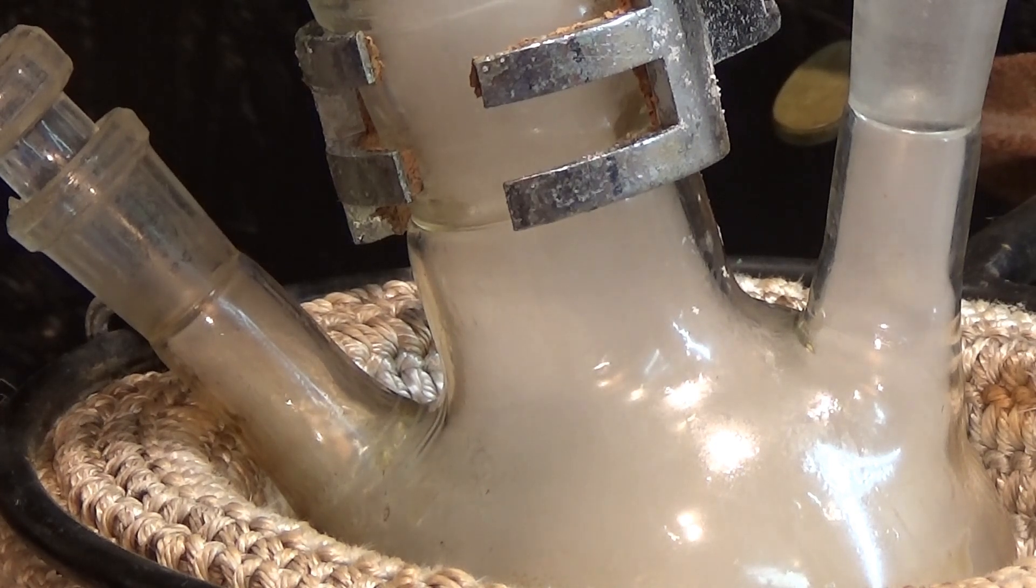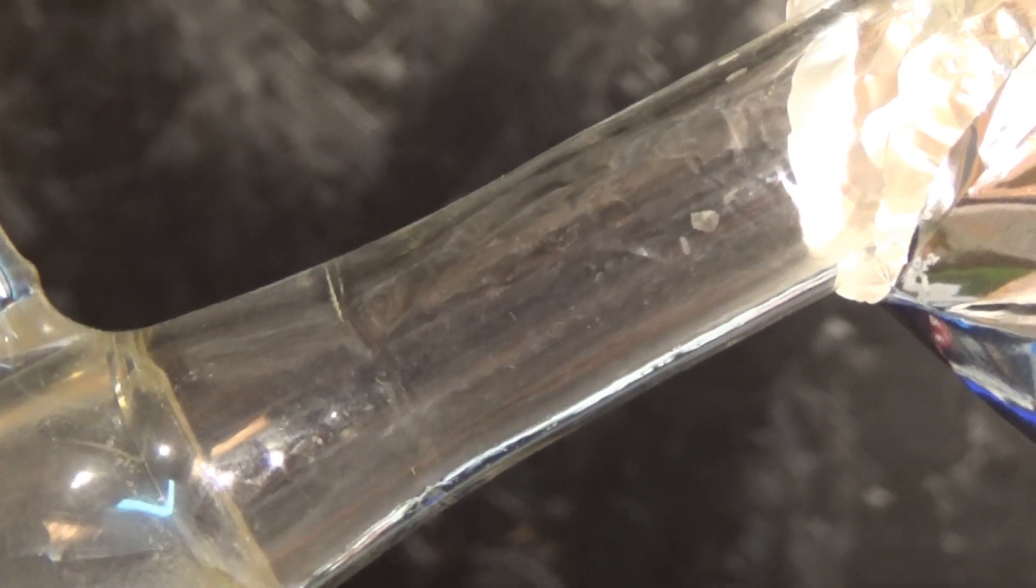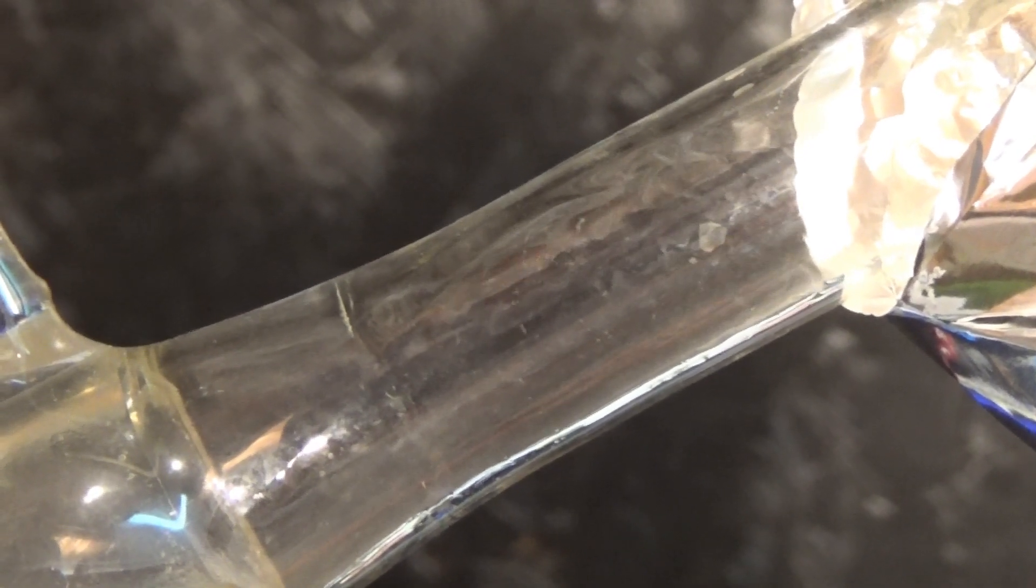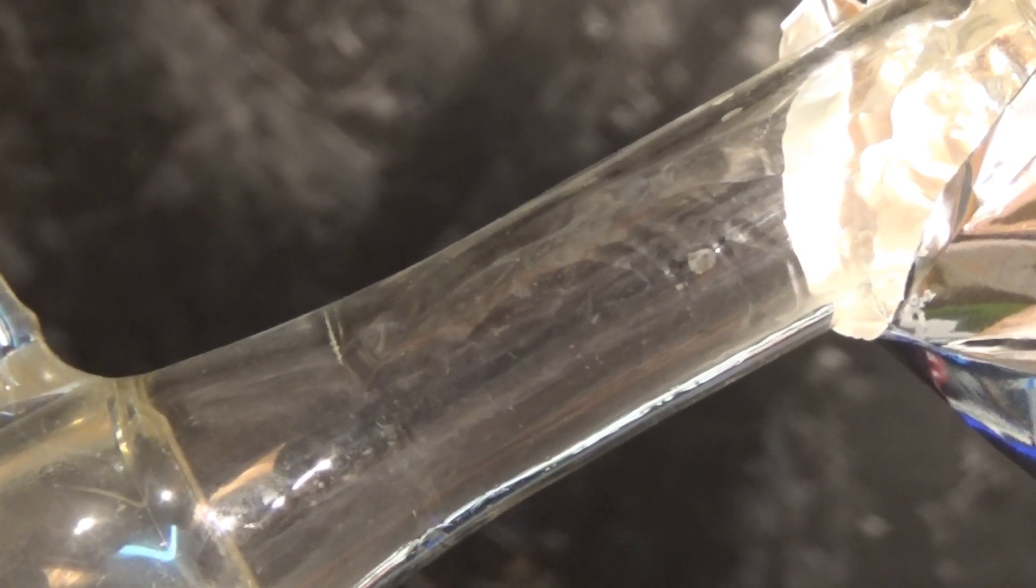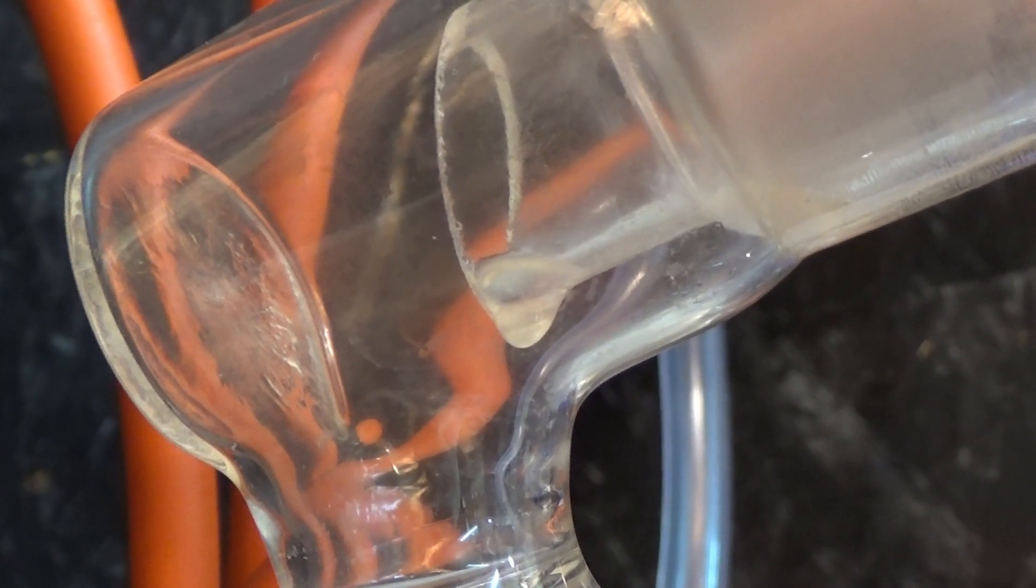This is perfectly normal for an amateur setup and can be dealt with later when the raw styrene is fractionally distilled. Also, it helps to insulate the entire setup with aluminum foil to reduce reflux of the styrene, which ultimately leads to more pyrolysis and a higher percentage of contaminants.